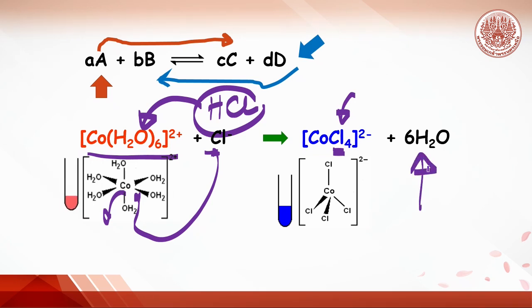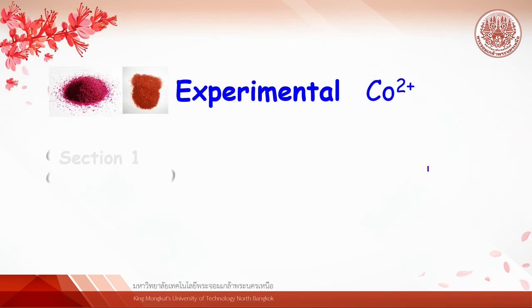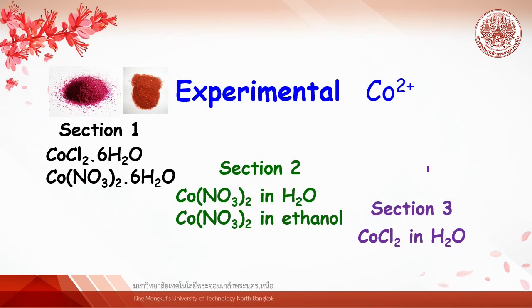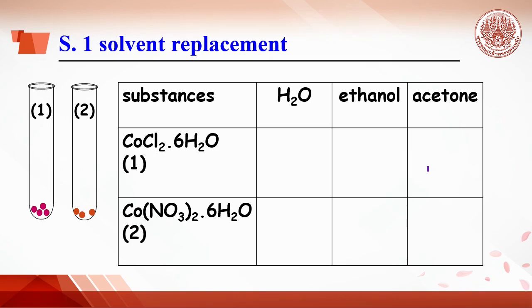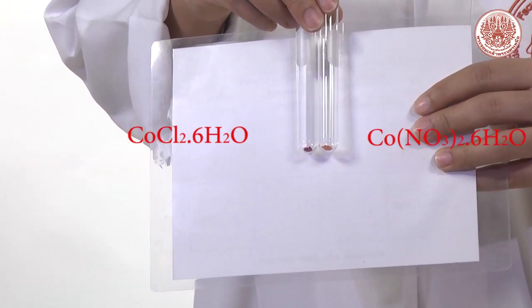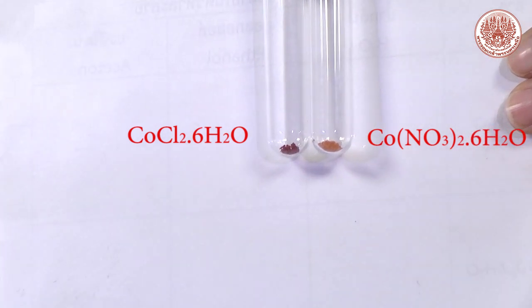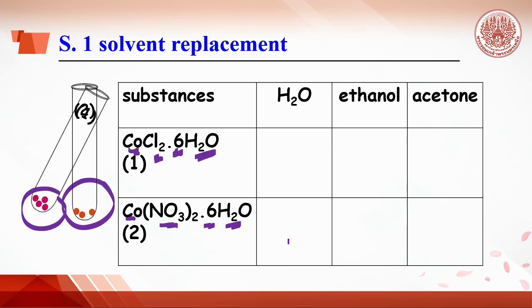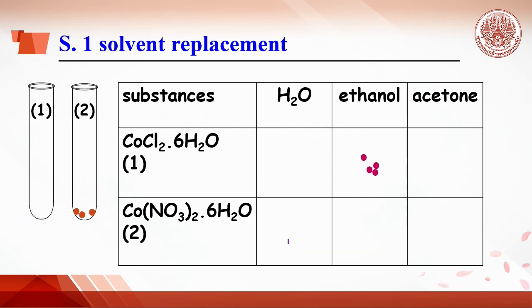There are three sections in this experiment. Today we use many types of cobalt solutions, so please look more carefully before doing the experiment. Section one: observe the crystal of cobalt chloride hexahydrate and cobalt nitrate hexahydrate. Pour the cobalt chloride on the plastic sheet and use stirring rod to separate the crystal into three parts. Do the same for cobalt nitrate hexahydrate.